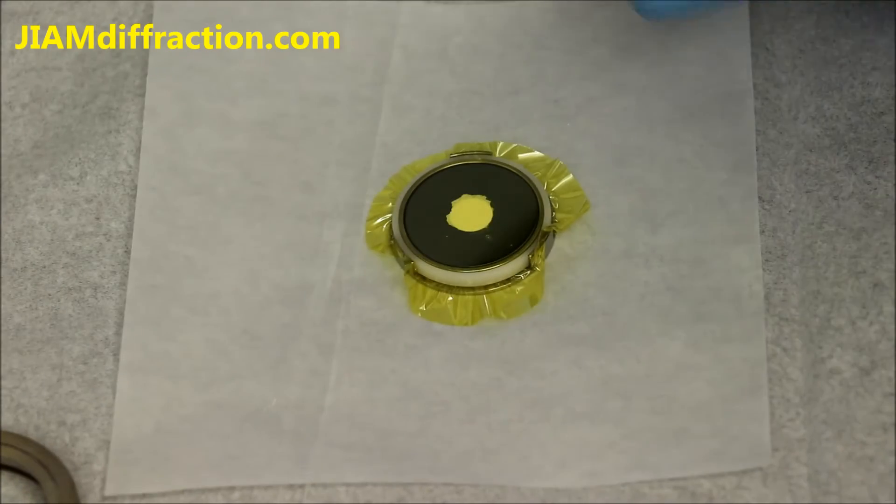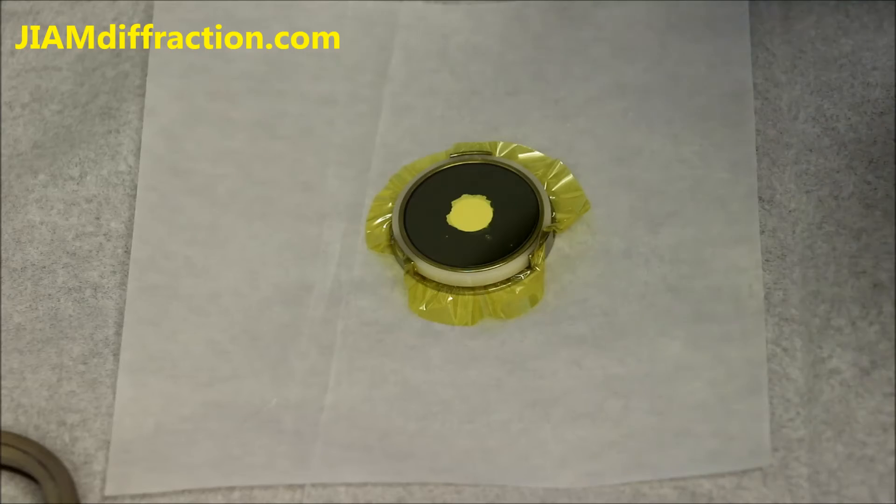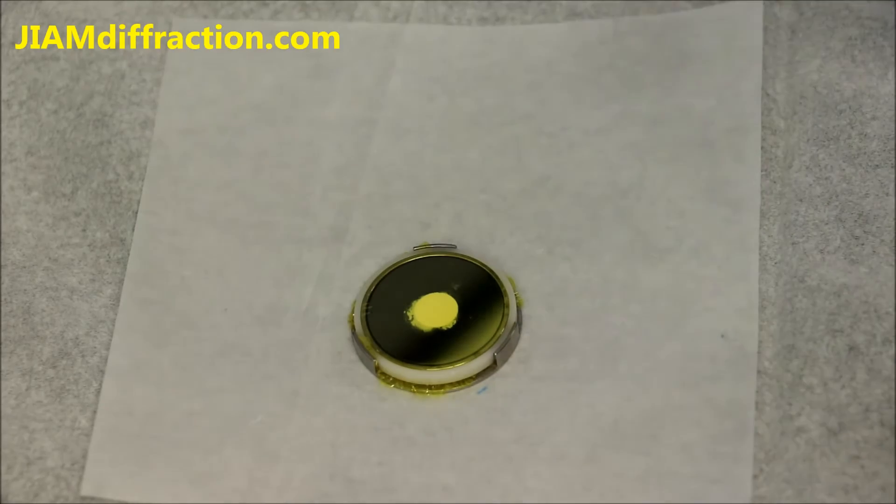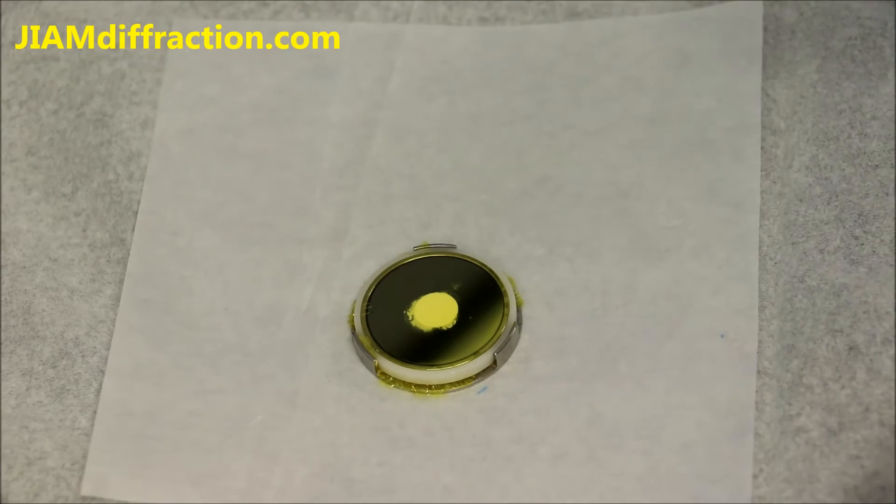And you can see now that the top of the sample is covered and sealed off by the ring. Now off camera I took a pair of scissors, made a couple of cuts in the Kapton film, and then tore away the excess.